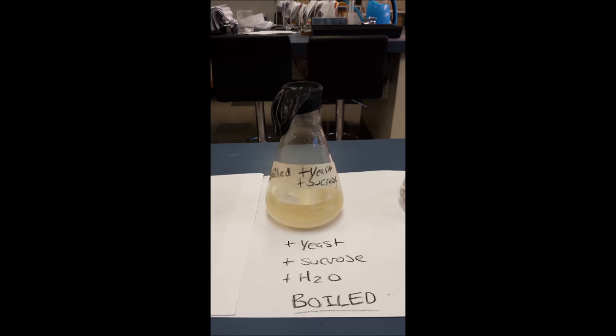This third flask had all that stuff, but it was boiled. What that did was that killed the yeast. So the yeast were dead, so they couldn't ferment all those sugars, so the balloon is not filled.